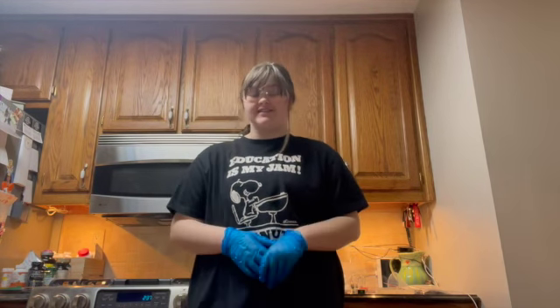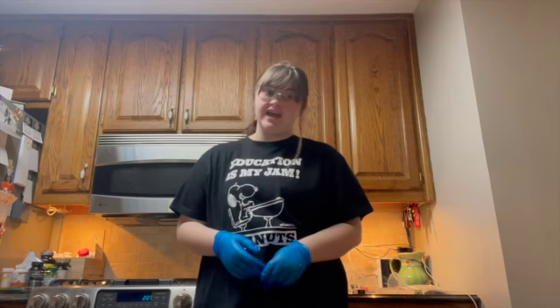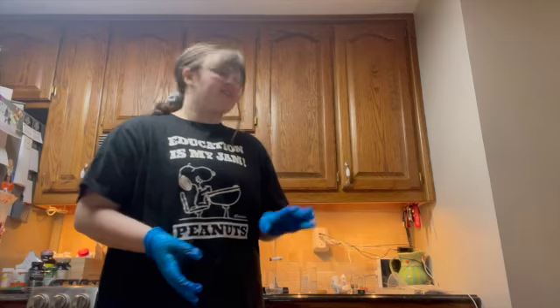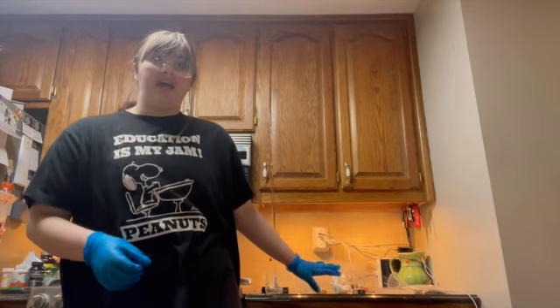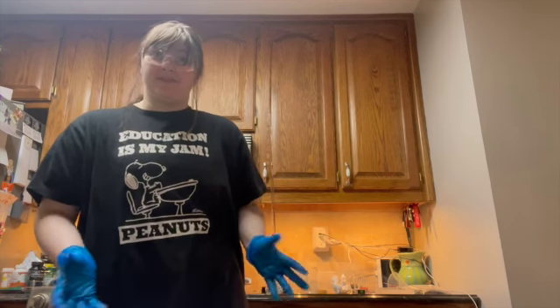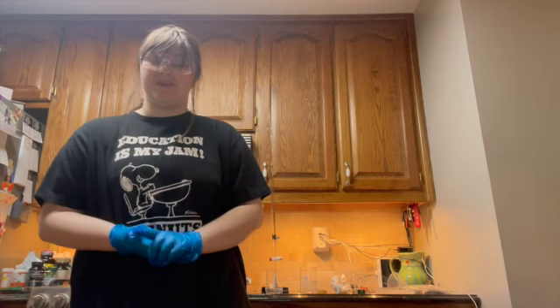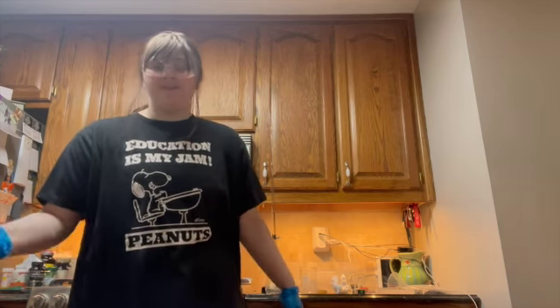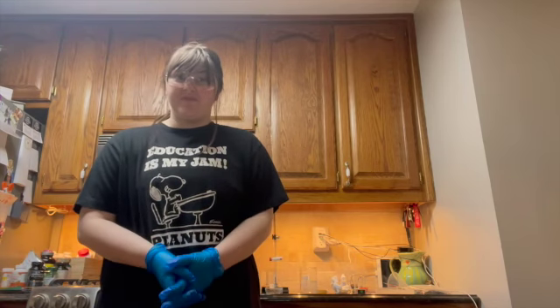Hello and welcome to Lab 4, our acid-base titration lab. Here I've already started with setting up everything, setting up the burette to how it's supposed to be, and our base and acid have already been made. So now we're about to start putting in 0.5 milliliters, titrating it into our substance.